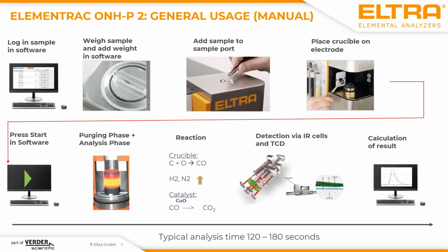And then everything is done automatically, which does mean you close the furnace and heat out the graphite crucible to free it from atmospheric gases, and the temperatures which can be reached are up to 3000 degrees Celsius. And at the same time, you flush the sample with inert gas like helium to remove atmospheric gases. And when the sample falls into the hot crucible after degassing, you have chemical reactions like forming of carbon monoxide and subsequently carbon dioxide.